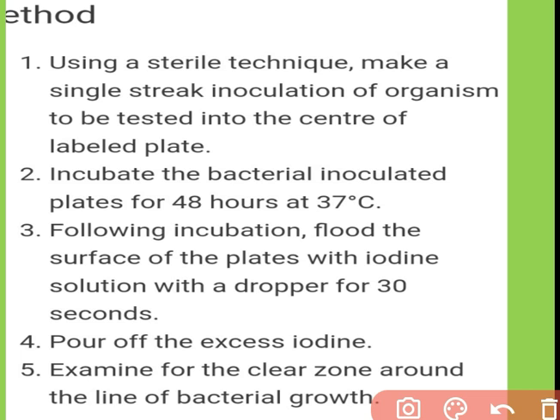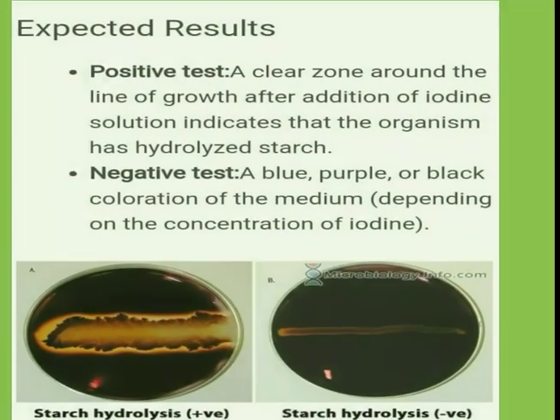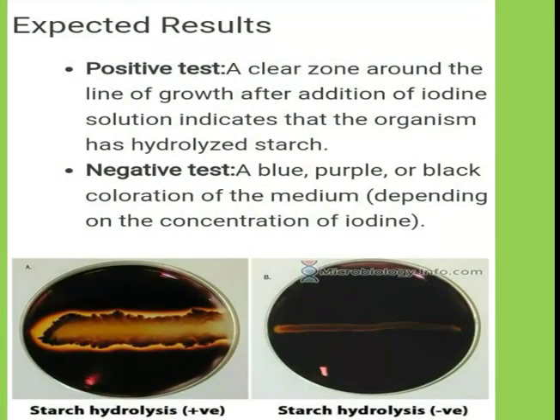After incubation, flood the plates with iodine solution for 30 seconds. Pour off the excess iodine. Examine the clear zone around the bacterial growth. If there is a clear zone around the bacterial growth, this clear zone is a zone of hydrolysis of starch. Expected results.